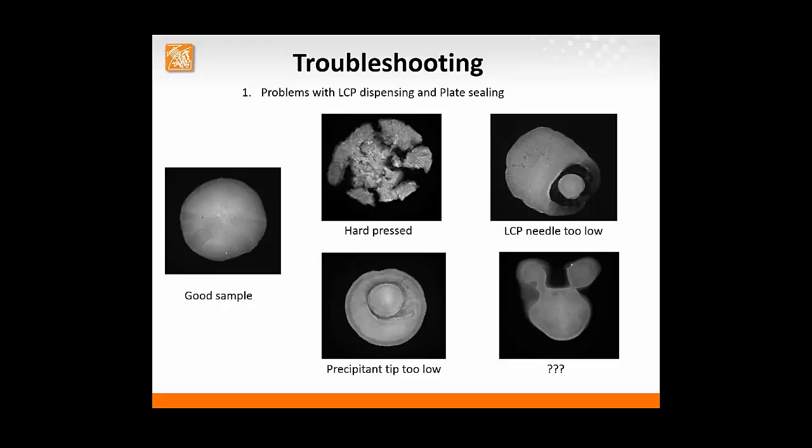Precipitant can only diffuse from the side in the sandwich plates, and it creates gradients of precipitant concentration that can affect the behavior of the protein in LCP balls. Therefore, the shape of the droplet is very important in order to compare different conditions.